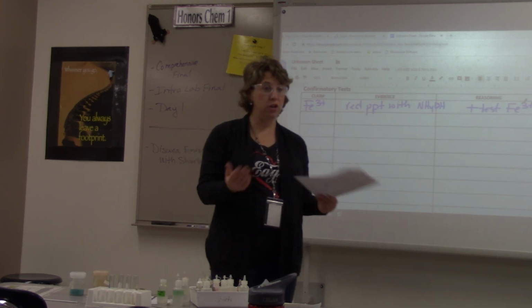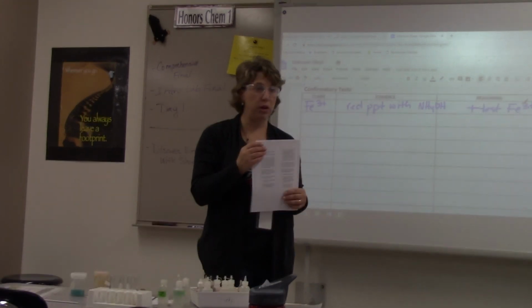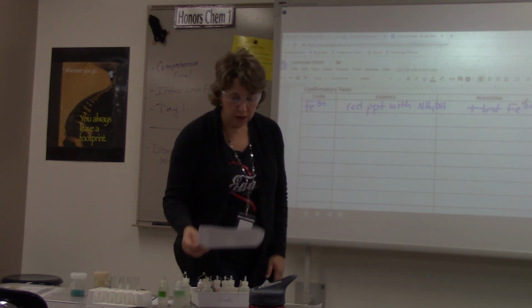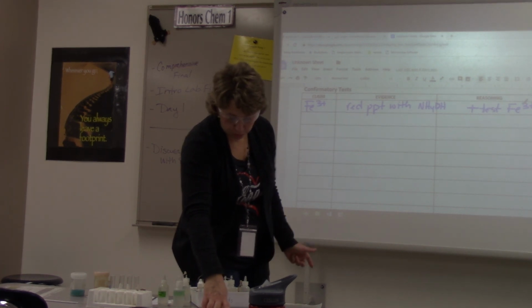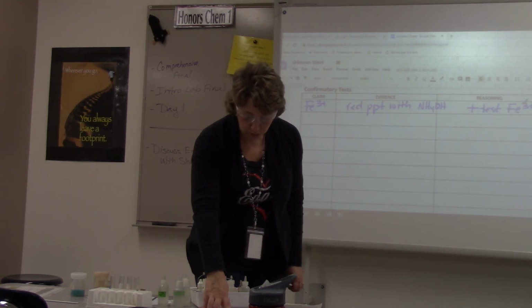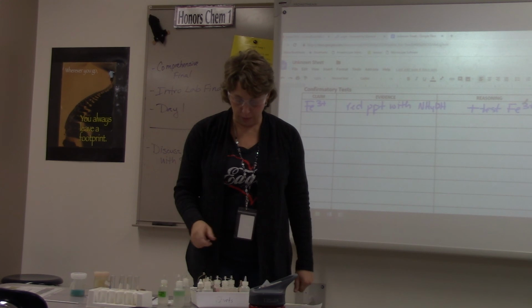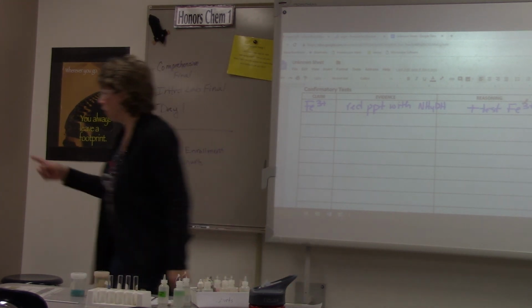Since we already know how to do a precipitate with silver, we're going to go ahead and try a brown ring test so I can show you how a brown ring test actually works. And so what we're going to do is follow the instructions for that brown ring test. As we look at that, all nitrates are soluble in water, so we're not going to find anything to precipitate with a nitrate. To do this, we're going to have to start over here, and then move to the fume hood in a minute. So again, I need another clean, dry test tube. So I'm going to actually use this one over here.